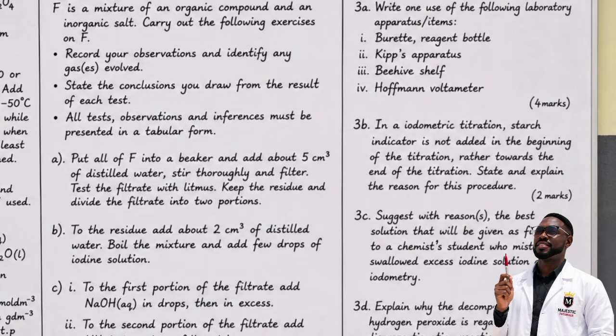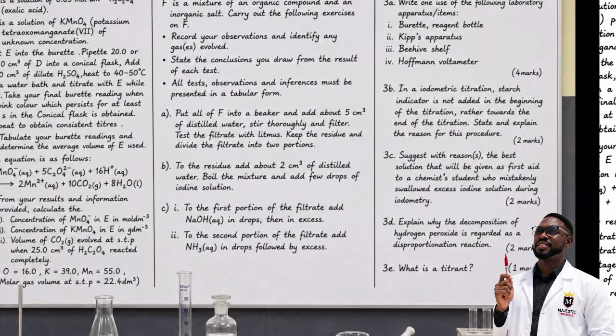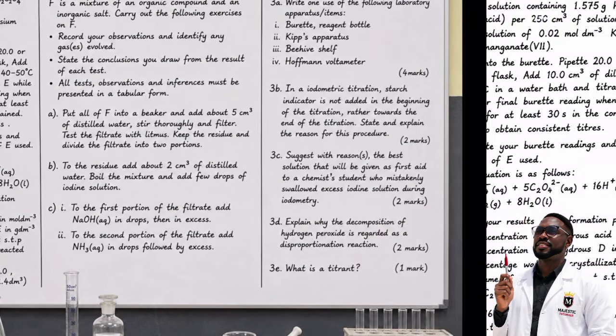And then 3B, 3C to 3D is just to widen your knowledge on titration, because number 3 is a subordinate question. Remember, you are going to answer number 1, which is titration, which gives the highest mark among the 3 questions. Then question 2 follows, and the least one is question 3. It is a random and subordinate question in chemistry. So see them here. I'll display them.